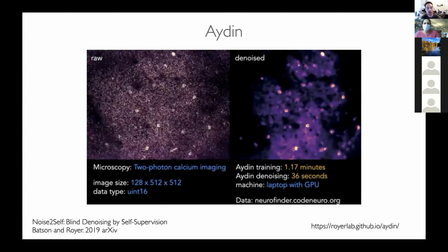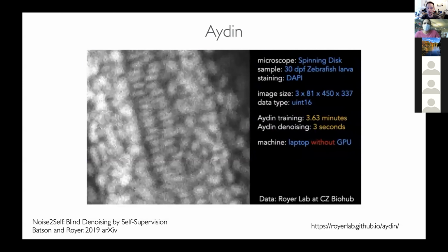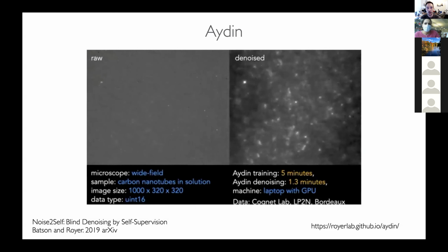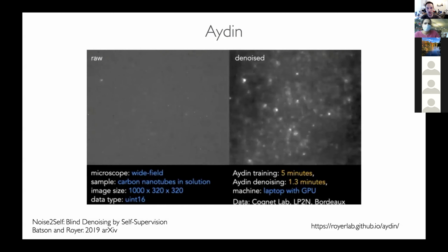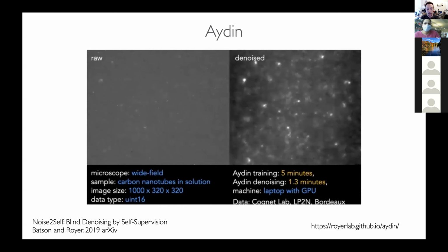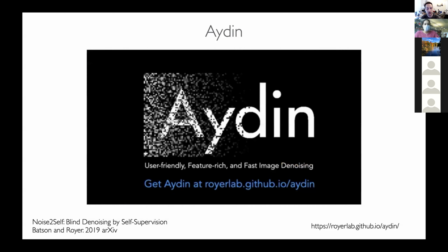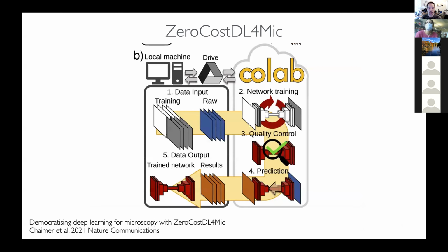These can be neural network algorithms, standard machine learning, as well as classical denoising tools, but they've gone to a lot of effort to make these accessible to anyone and combine them with a lot of tools for things like motion correction and regular noise and other things that we're often facing when we're trying to do advanced microscopy. I'm hoping these slides really stimulate you to think about these things that are available and that I can start using for my research.